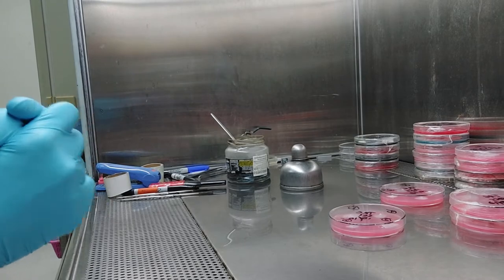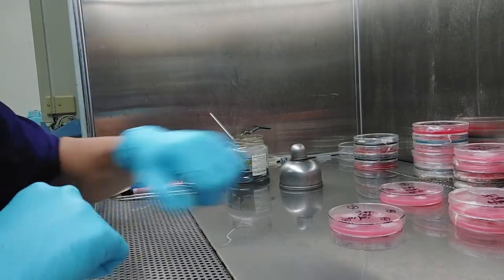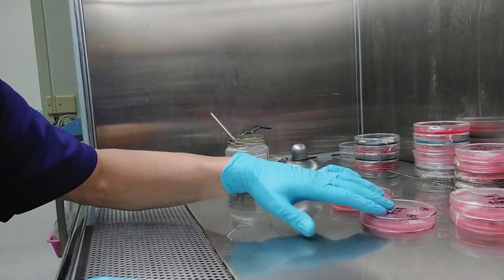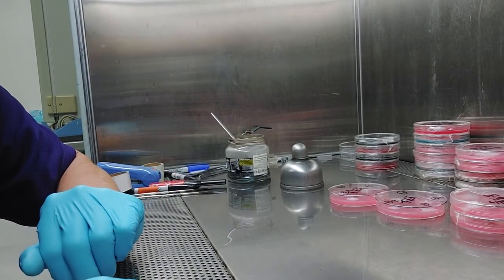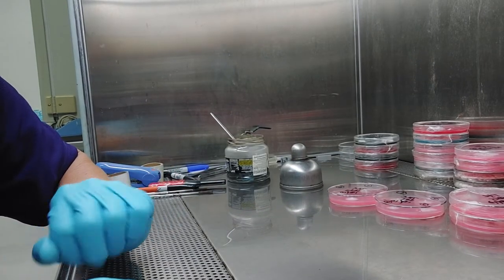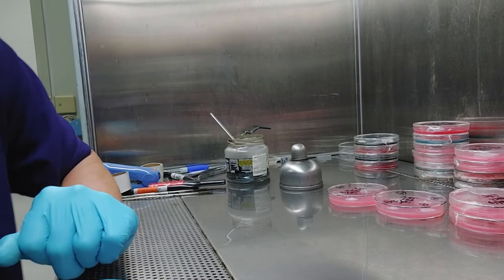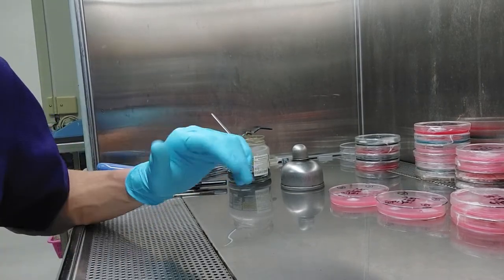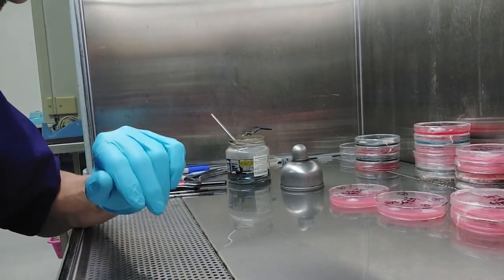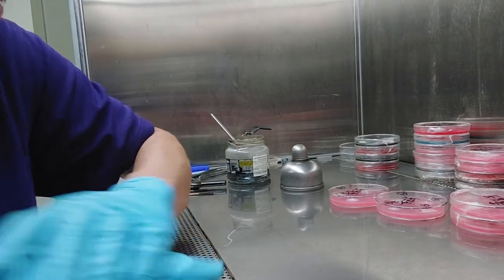So for all you people out there who are getting into mycology, probably if you're doing this you're not just getting into it, but get used to washing dishes and throwing stuff away. That's what I always tell people now. If you don't like washing dishes, don't get mycology as a hobby.